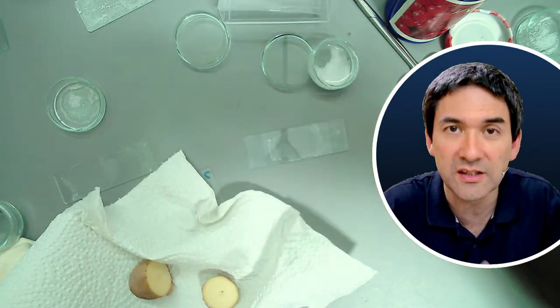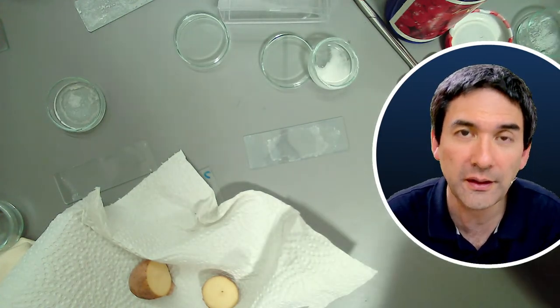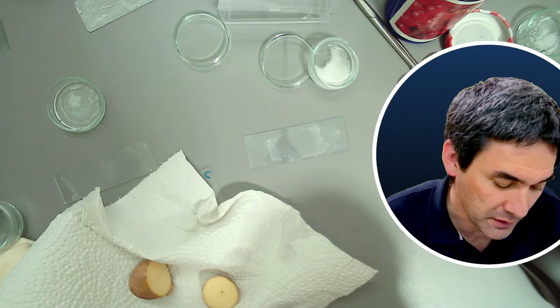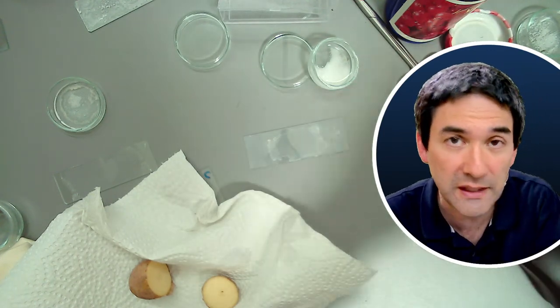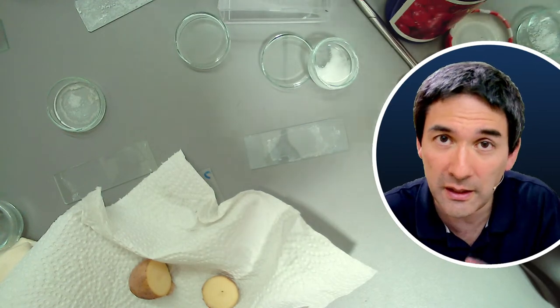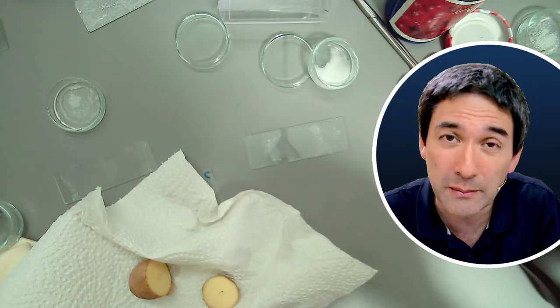Essentially the crystal is surrounded by air. And that's going to be fine, because when we look at it under the microscope, then it's also surrounded by air, and at low magnifications you don't need a mounting medium anyway. And maybe sometimes even the difference in refractive index from the crystals to the air is something that you might want anyway, because if it's surrounded by a mounting medium that has a refractive index similar to the crystals, you might not be able to see it as well.